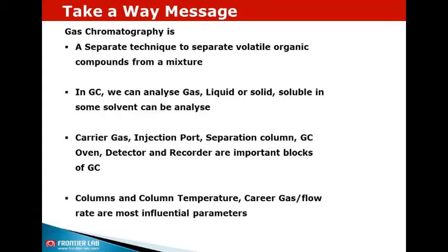So you can see this is a sample that is injected into the injection port. So after volatilization, this volatile compound is coming to the column where the separation is occurring. Then it produces a different signal depending upon the type of compounds present in the mixture.